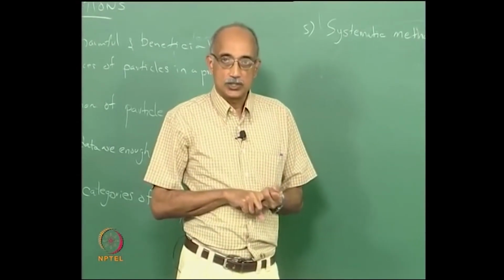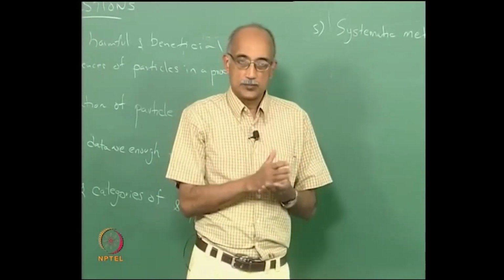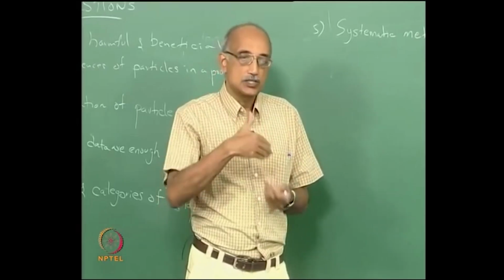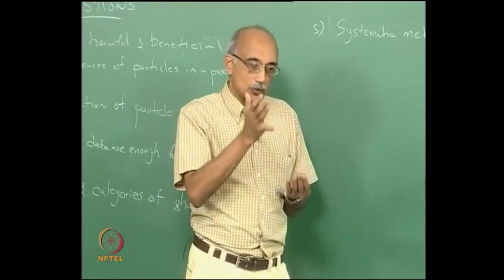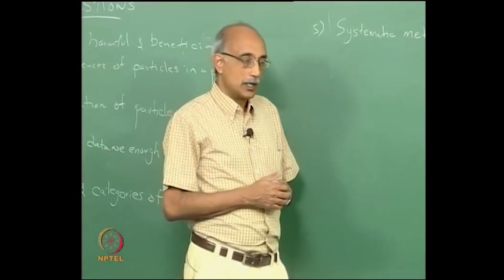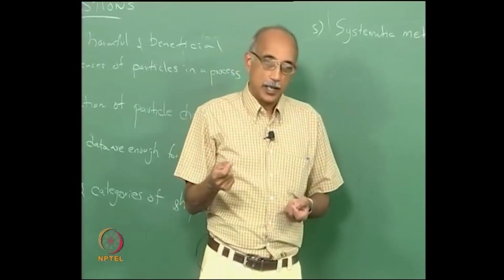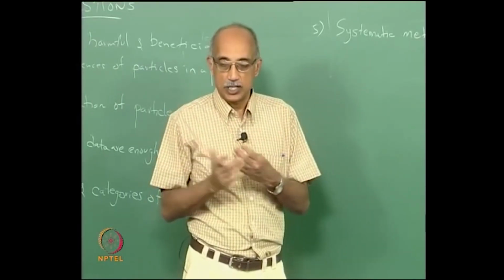You have to establish certain rules that say that when I compare this particle to one of my reference particles, I will use these rules to say whether this particle is closest in shape to this or this or this from your reference library.